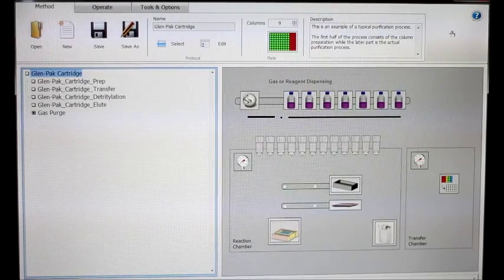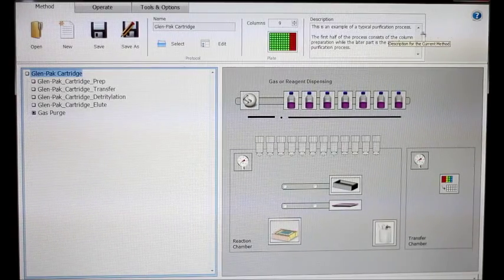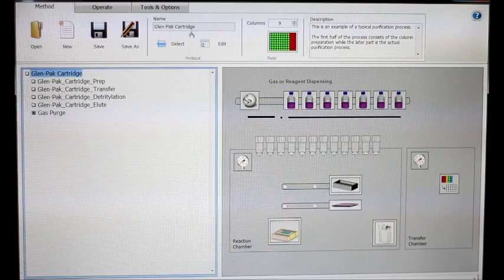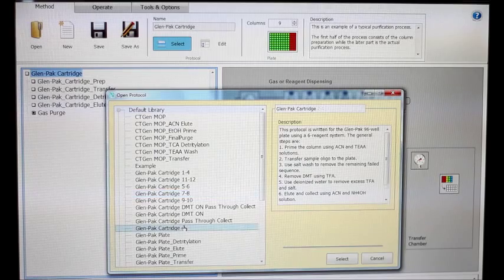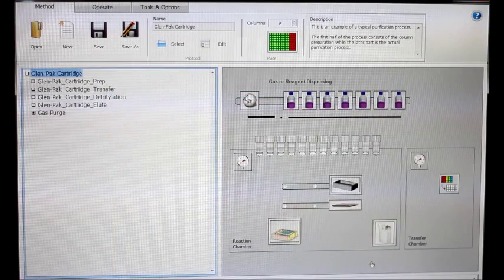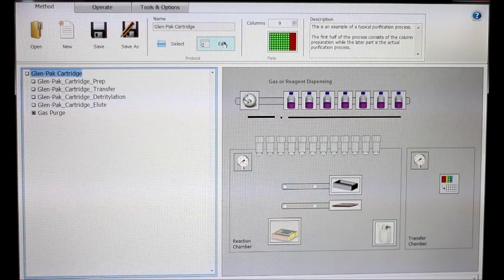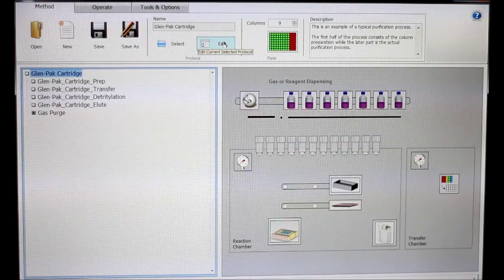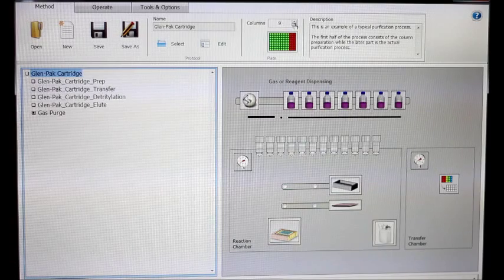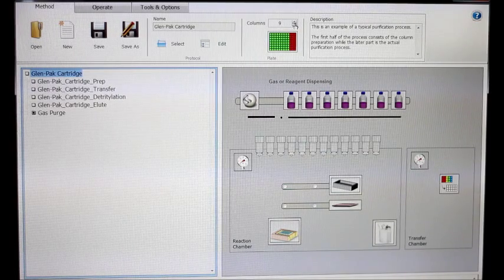The top main toolbar is where you select the protocol you want to run along with the number of columns. To select a protocol, first click the select protocol tab. Select the protocol you want to run from the drop-down menu and hit OK. You can also edit an existing protocol or add a new protocol using the edit protocol tab. The column field is where you select the number of columns that you want to run for your given process.